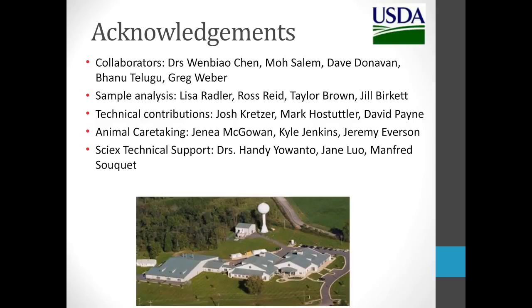And so that introduces the concept of using some of the genes of interest as a housekeeper. For example, in our protein degradation plex, we have ubiquitin. And ubiquitin never seems to change. And so we're looking into using that as a housekeeper as well. So we have 4 built in there, but there also are opportunities to go to others that clearly are not regulated by treatment.